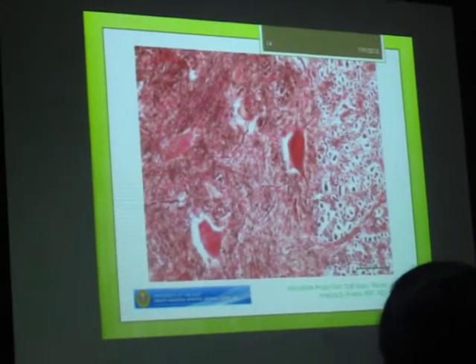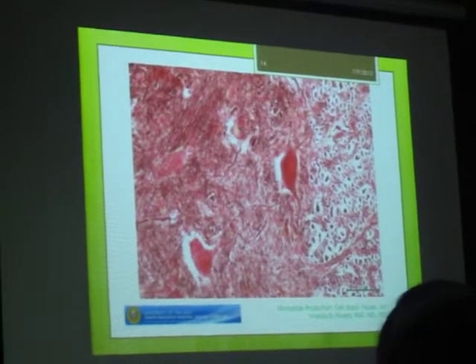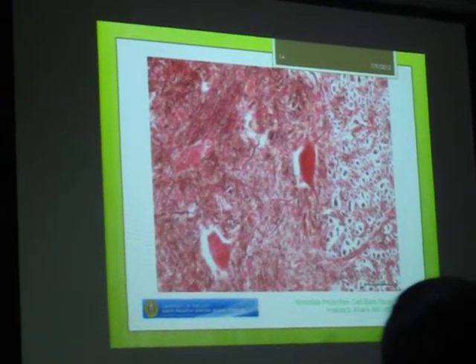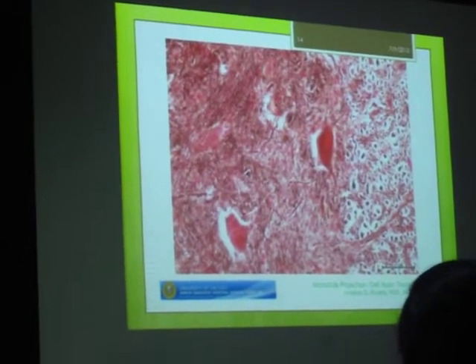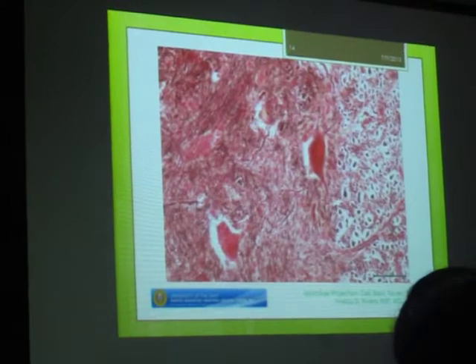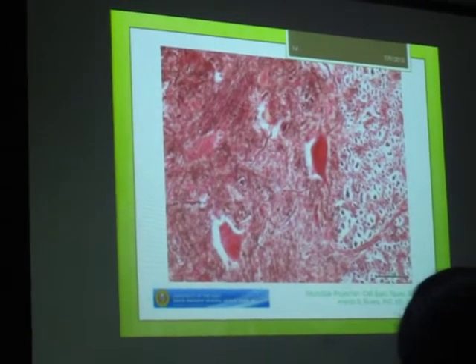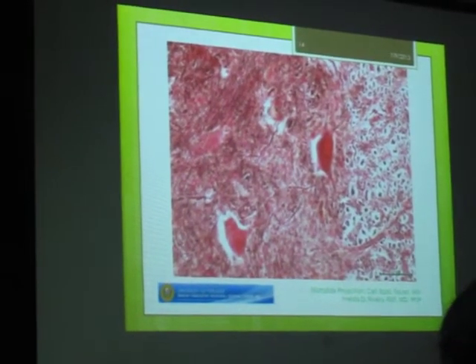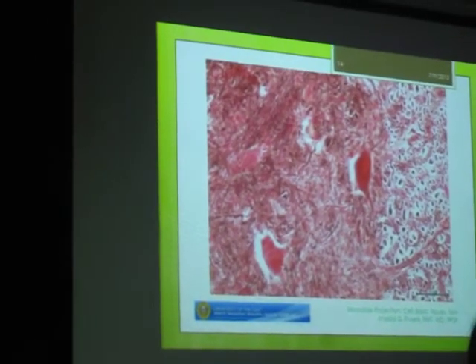Okay, so motor lang, that's the only neuron actually that you can identify. Multipolar. Okay, but you can identify the others later in other modules, like in the eye, ophthalmology, sa mga ear, yung mga sensory organs, sa retina.